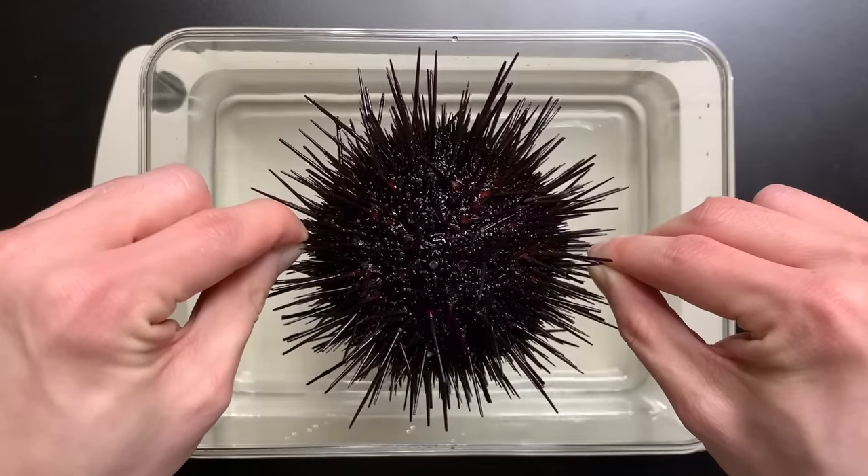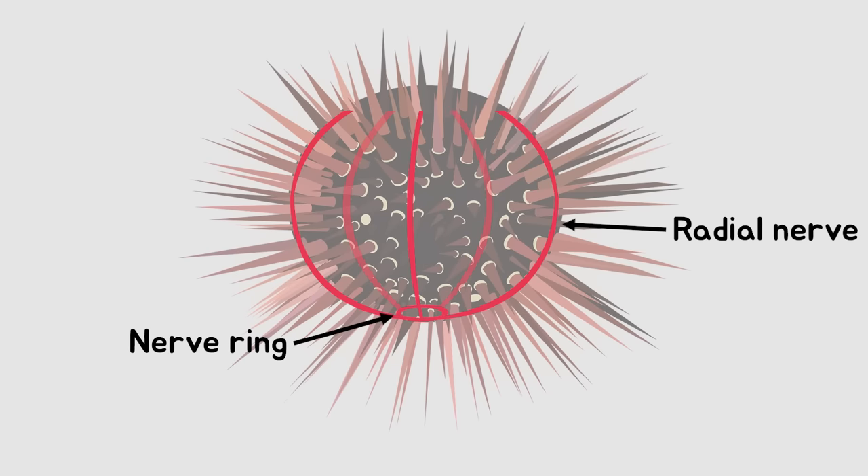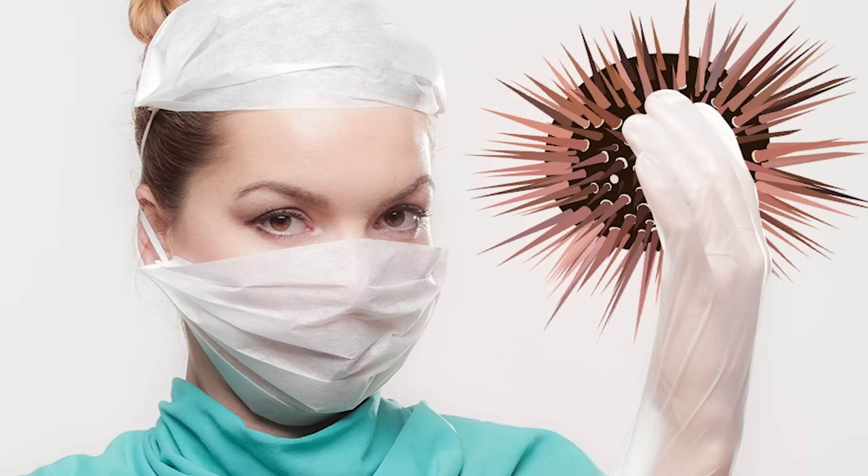Lastly, if you look at the nervous system of sea urchins, you can find that they do not have brains like starfish, but only have nerve rings and radial nerves. This is the end of the sea urchin's anatomy.